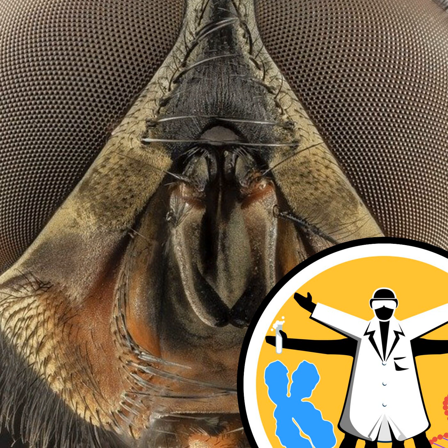And on the opposite side, we found that the whole mash fly had both the epibiont and the intestinal insect signatures. If you were specifically looking at just gut bacteria, then the ideal scenario would be, of course, to dissect that out of many, many flies, and your hands would get really tired and you would hate yourself by the end of it. But you'd want to dissect them all out and then just run your extractions on that. I found that my 15-year-old dissection skills weren't quite up to the job. But it is really promising that your controls worked, right? You found that there were species of bacteria that should be on the outside and they were there, and there were species of bacteria that should be on the inside and they were also there.